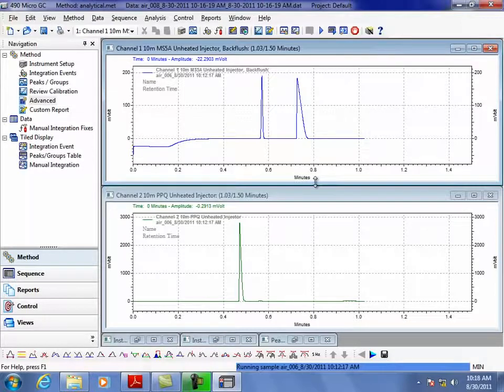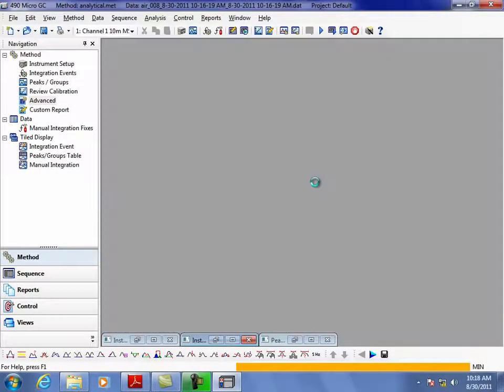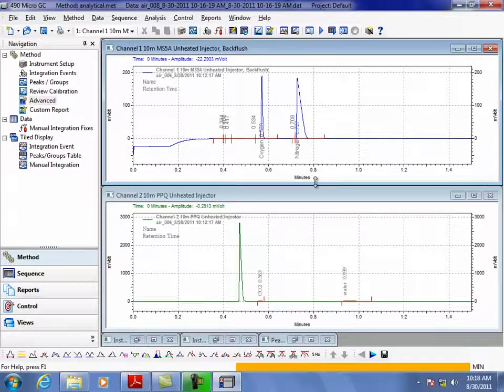There are exceptions to the rule as well. When you get a mole sieve wet, you can flip the CO and the methane. So it's good to know if you get a standard made up of the compounds of interest, get them in different quantities. Don't get a 1% standard of everything. All the peaks are the same height. How do you know the difference? If you do 1% oxygen, 5% nitrogen, 2% methane, you can tell by the area counts which one it is, right? Not just the elution order.